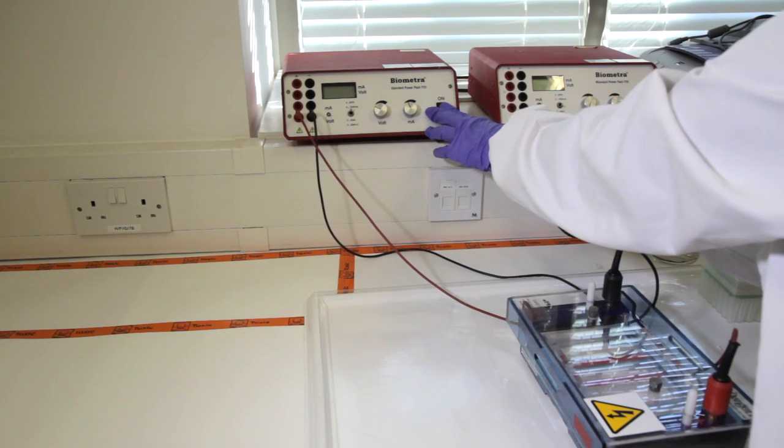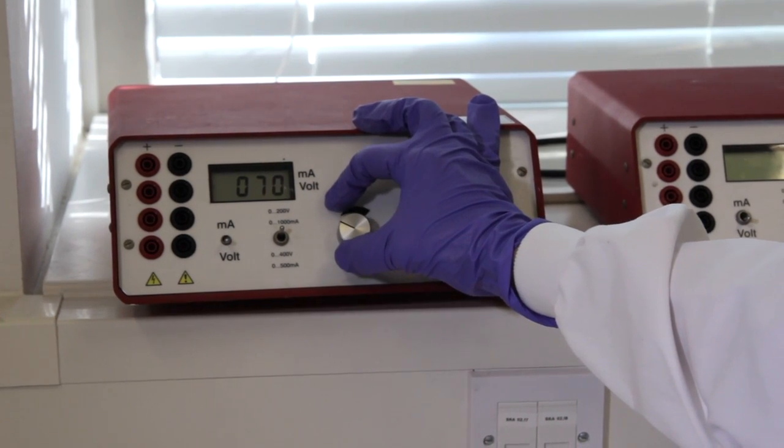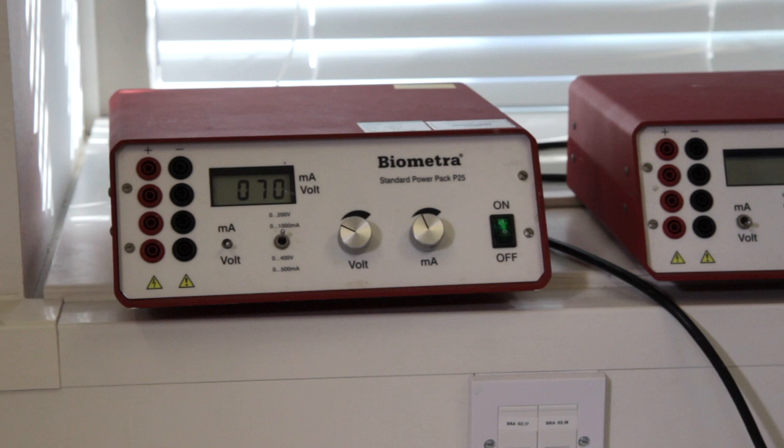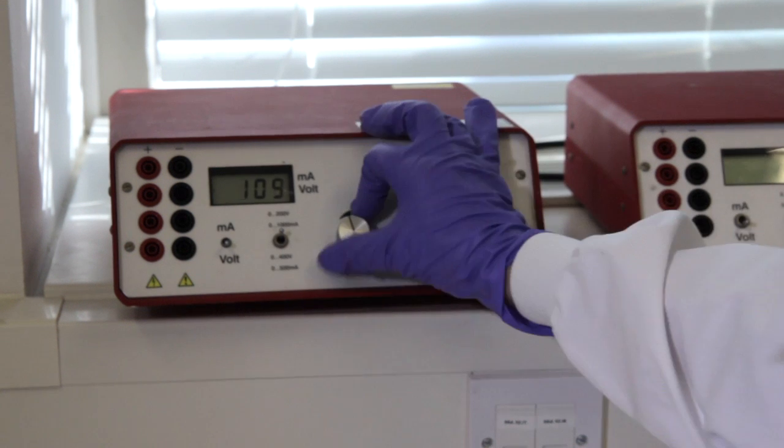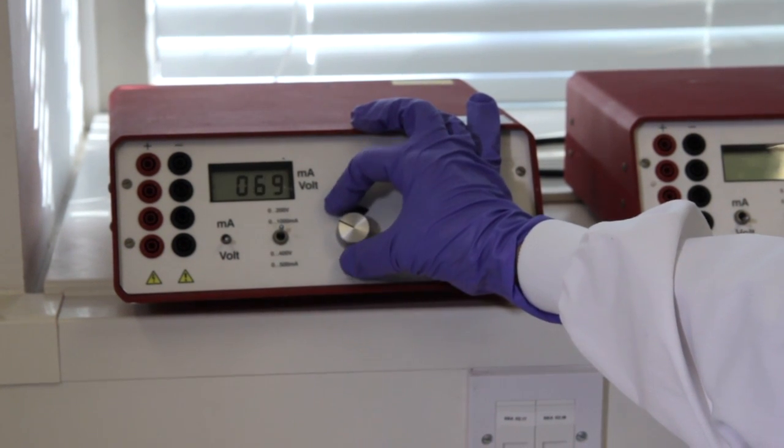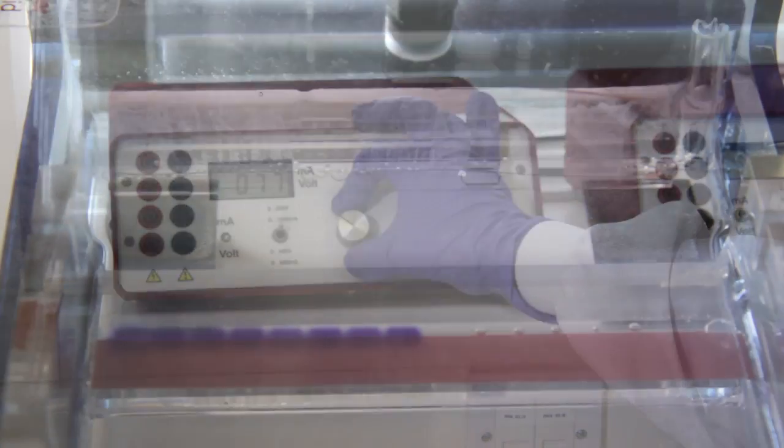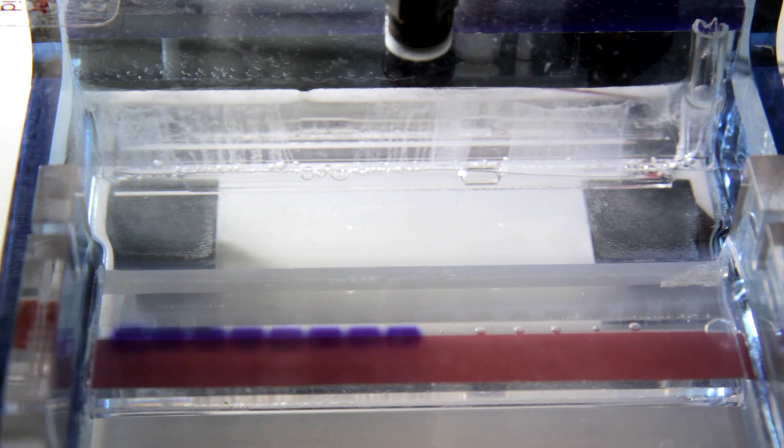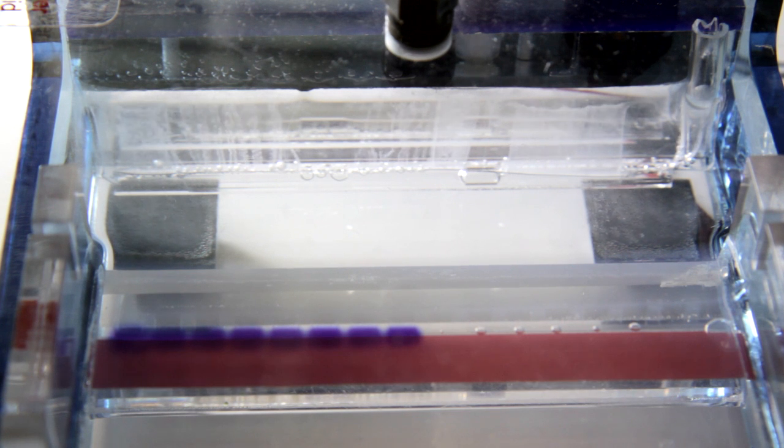Turn on the power supply and set the voltage. Small gels run typically at 50-70 volts. Larger gels can be run at 80-100 volts. You can check the current by changing the volt amp switch to amp. There can be voltage but no current if there is a break in the circuit. Current is typically around half the voltage if your buffer concentration is correct.